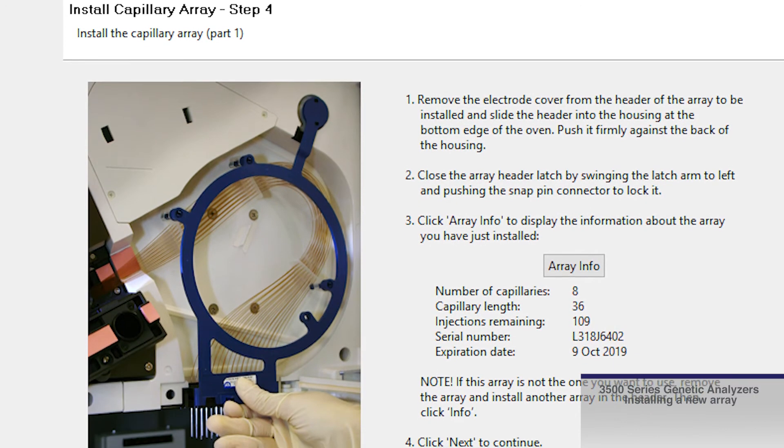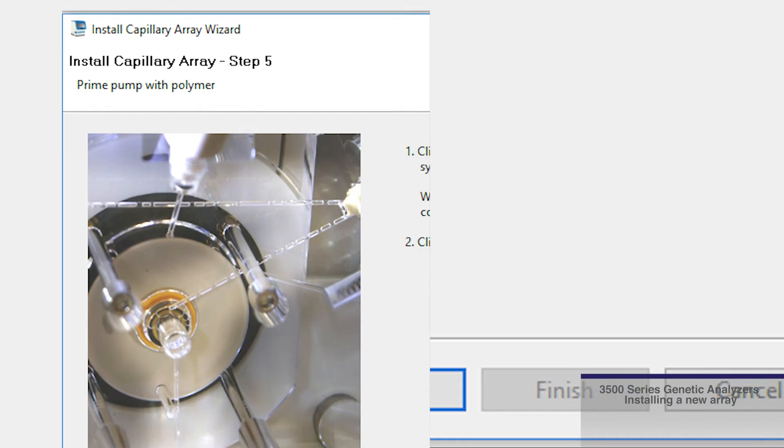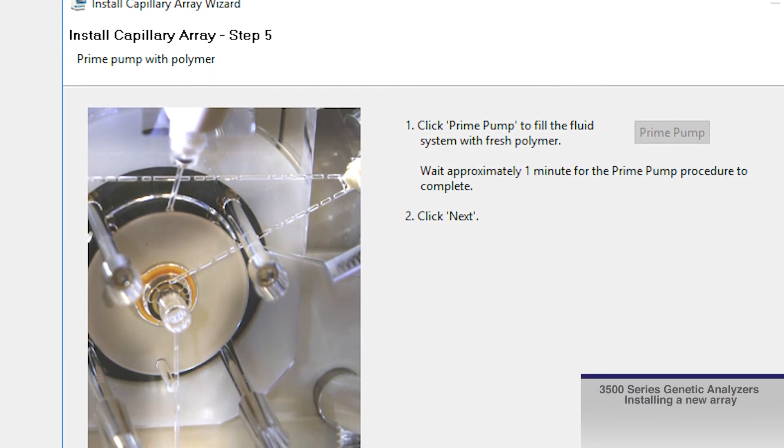Now that the array is properly installed, follow the prompts on screen to finish the installation wizard, clicking Next after each step is performed. These steps include the prime pump command, which fills the system with fresh polymer.